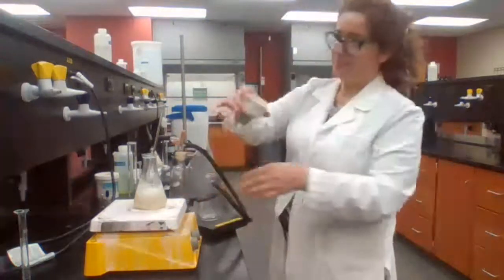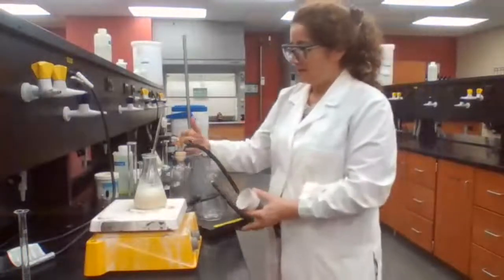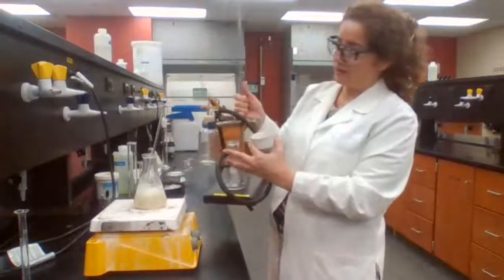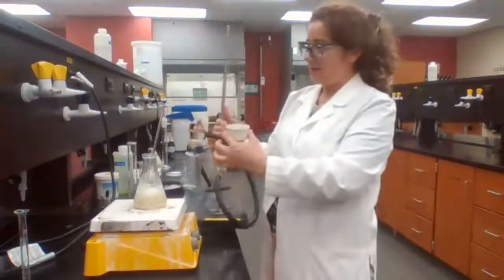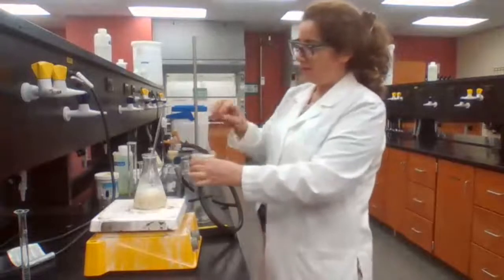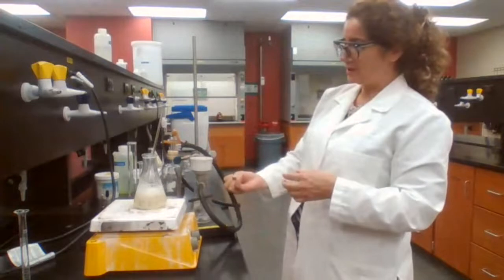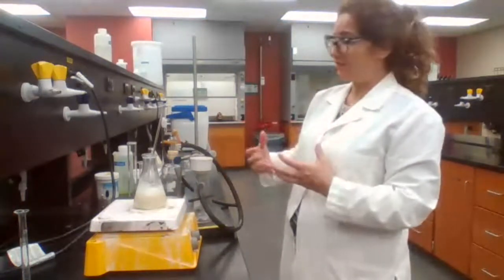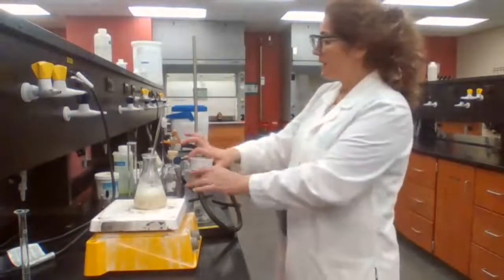It's made of a Buchner funnel and a vacuum flask, which is a flask with a side arm that we can connect to the vacuum system. When we pour the solution, the vacuum pulls the solvent through by force for maximum efficiency and faster filtration.